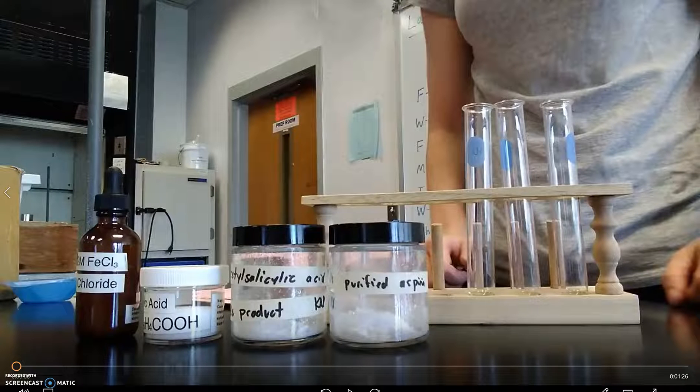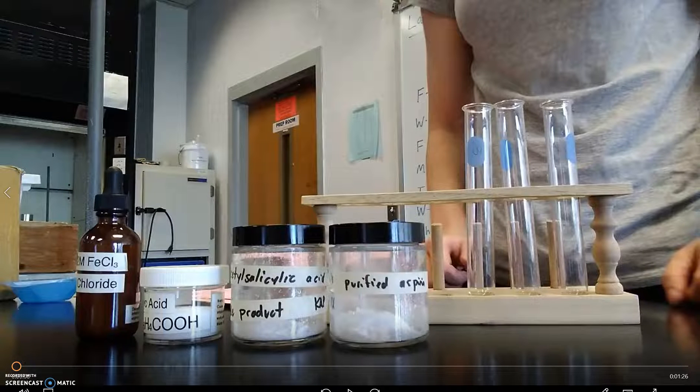Hello chemists, this is Ms. Pluccino and in this video we're going to talk about the three different techniques that will be used to analyze the purity of your aspirin products.